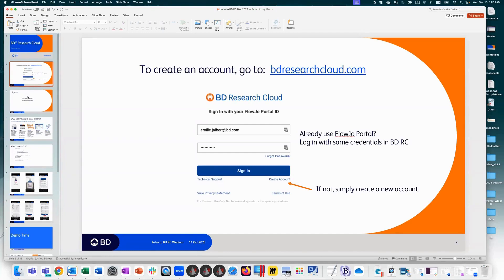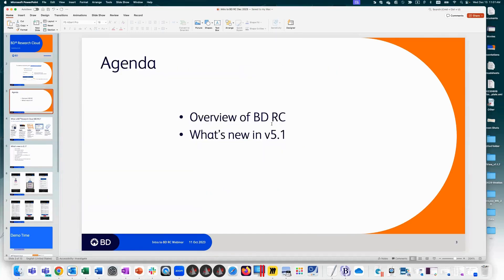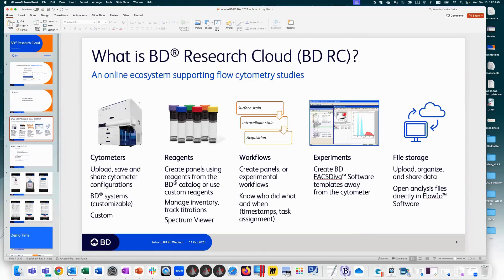I'll do a brief overview of BDRC and its capabilities, then focus on what's new in version 5.1. Research Cloud is an online ecosystem supporting flow cytometry studies. You can upload, save, and share cytometer configurations — BD instruments or non-BD. Using that cytometer information, you can create panels using either BD or non-BD reagents. You can also manage your antibody inventory and track titration information, and I'll demonstrate how to pull that into your staining sheets — a new feature in 5.1.